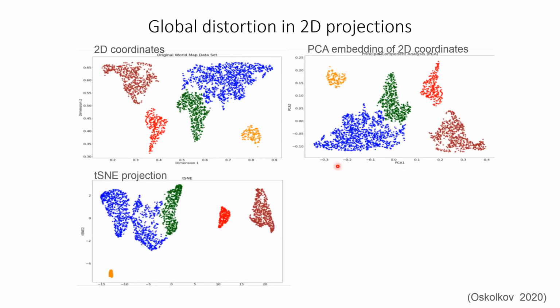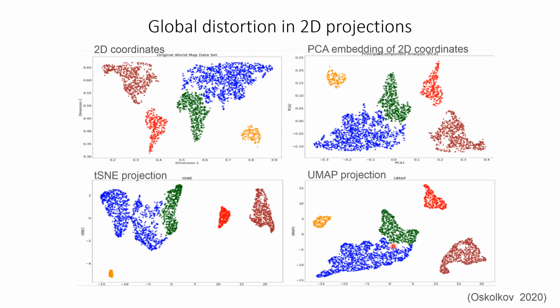However, when we apply t-SNE or UMAP to the same data, we do not achieve the same global distance preserving effect. t-SNE is designed to retain pairwise distance relationships, while UMAP projects fuzzy topological neighborhood representations. Both use nonlinear approaches and are not designed to prioritize the preservation of global structure.